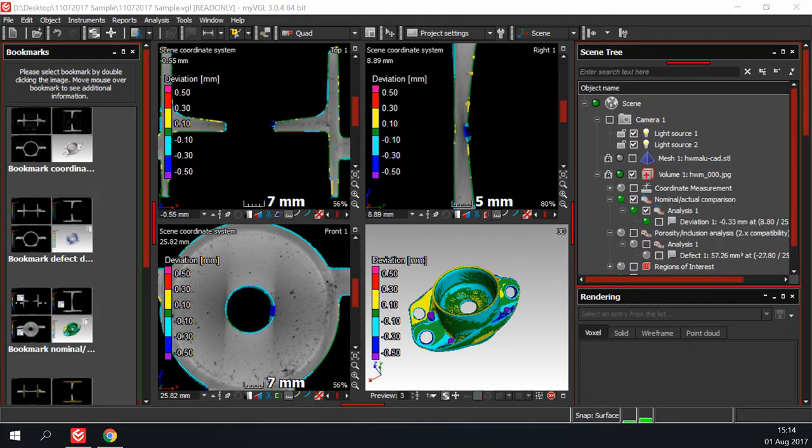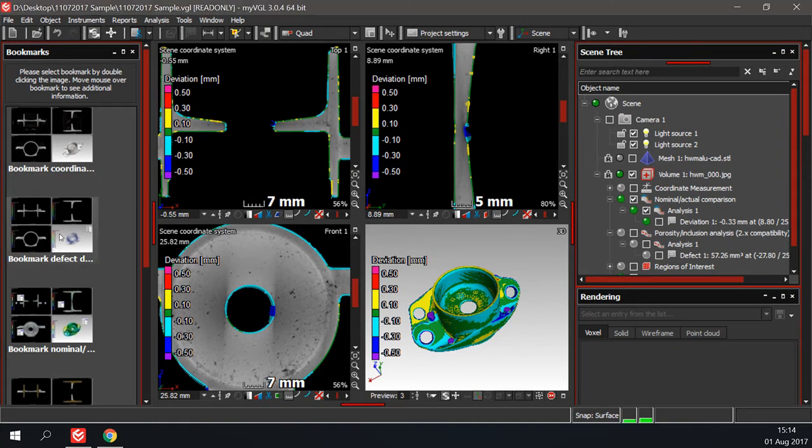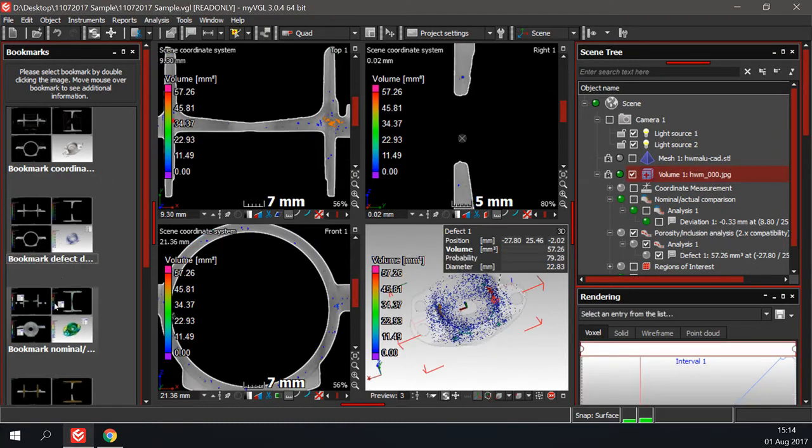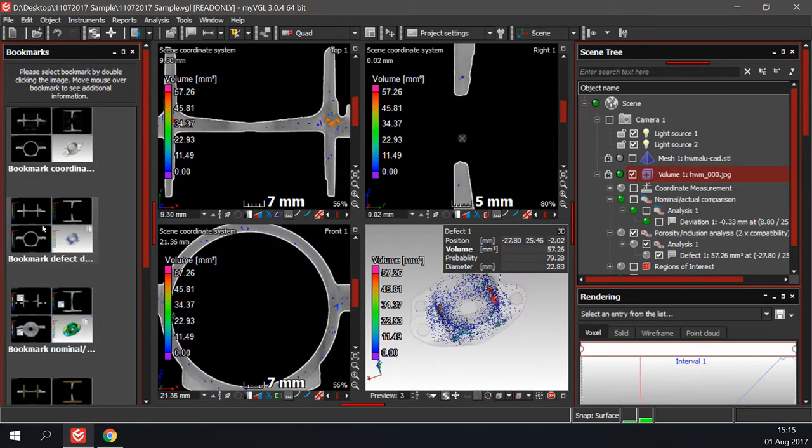The first window we will look at is the bookmarks bar to the left of your screen. The bookmarks act as a shortcut to specific analysis that was performed on your data. Double click on a bookmark and it will display the analysis. This is just a convenient way to quickly jump between the different analysis.